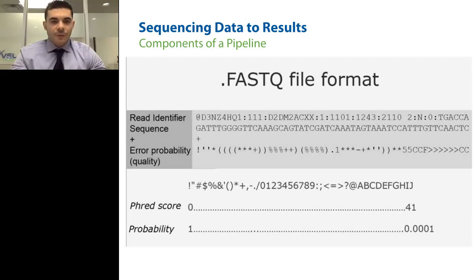You'll have the same information that your FASTA file will have. We'll have basically a sequence identifier and your sequence itself. In this case, for a FASTQ file, you'll also add one more component, and that's a quality score. This isn't really interpretable as humanly read, but it is encoded in ASCII format for brevity.